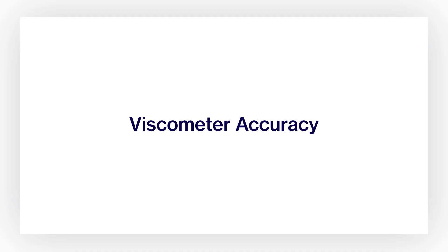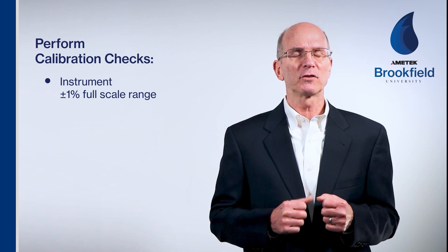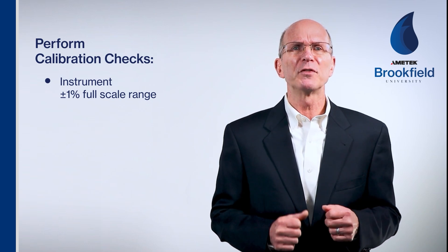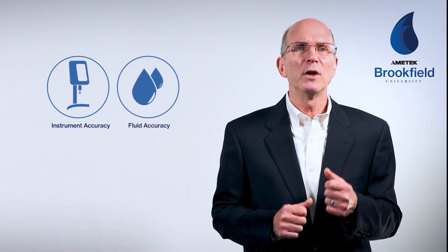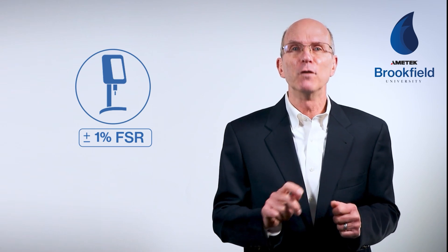Building on your understanding of full-scale range and its impact on selecting the proper spring, spindle, and speed, we'll now discuss viscometer accuracy, calibration check procedures, and instrument care. You can perform calibration checks to assure that your instrument is meeting the accuracy specification of plus or minus 1% of the full-scale range. When performing a calibration check with a known viscosity standard, you must consider both the instrument accuracy and the fluid accuracy.